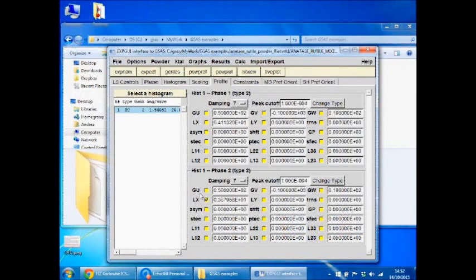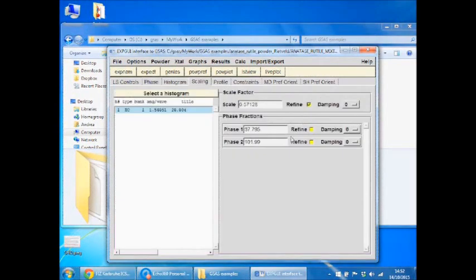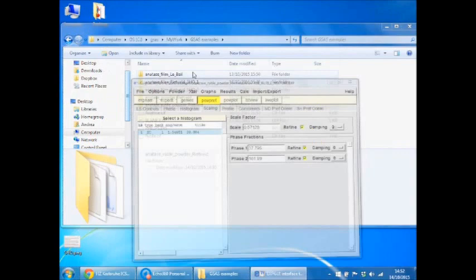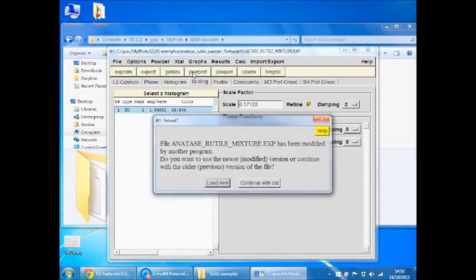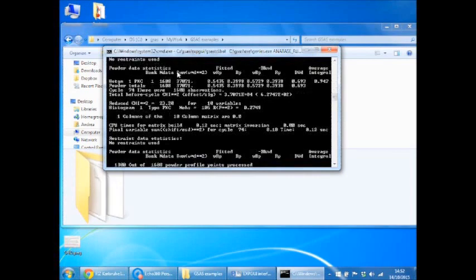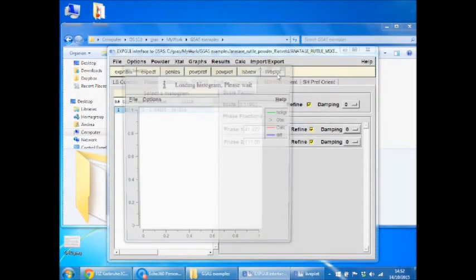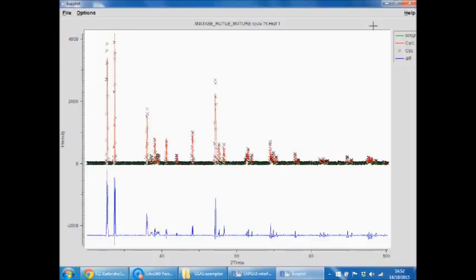So what I'll do is I'll turn these things off, turn these things back on. Check that everything's okay. It's fine.